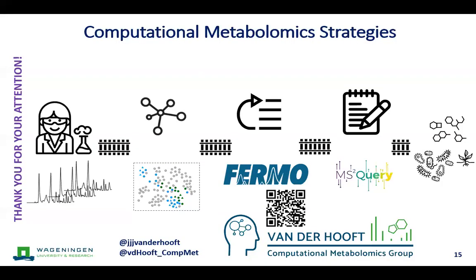So with that, I want to give the word back to Florian to show you how we can now use the results from MS2Query to map back on the spectra from the experimental data and see what we can learn.